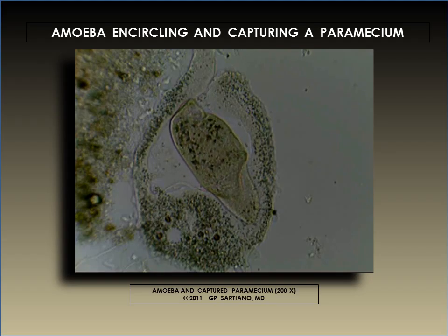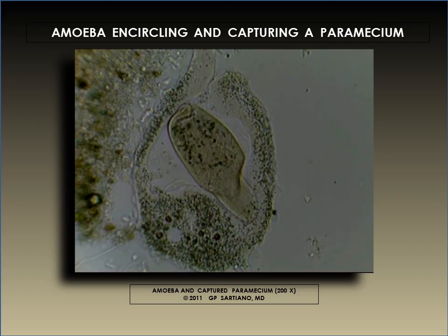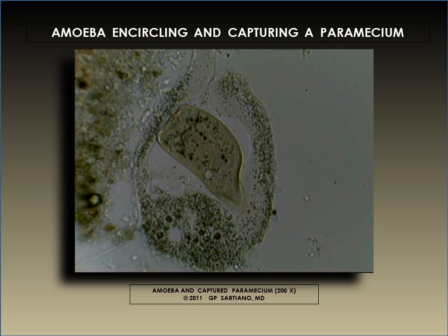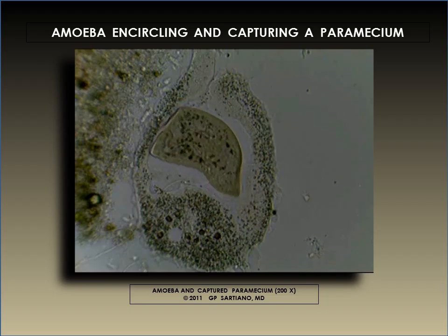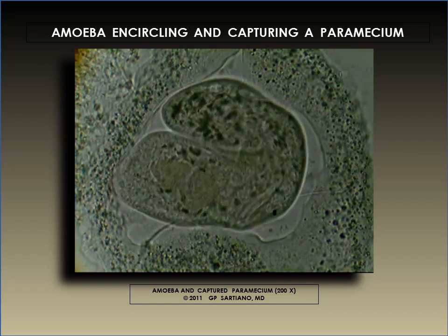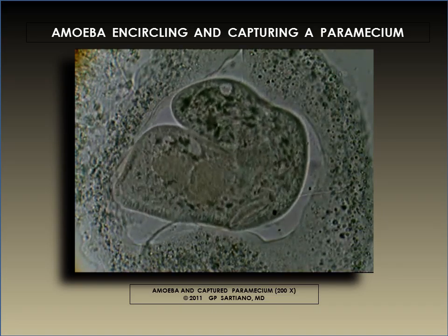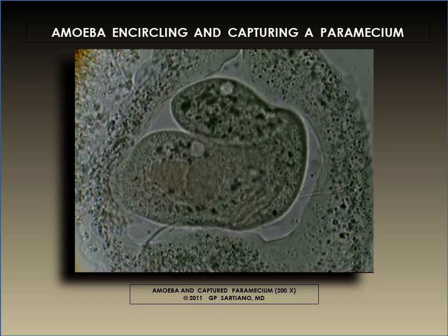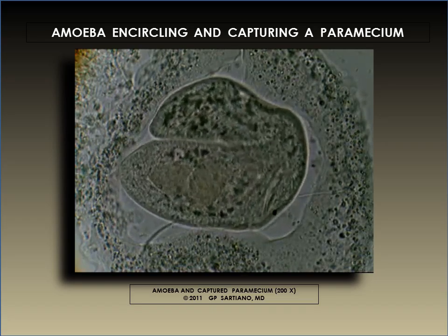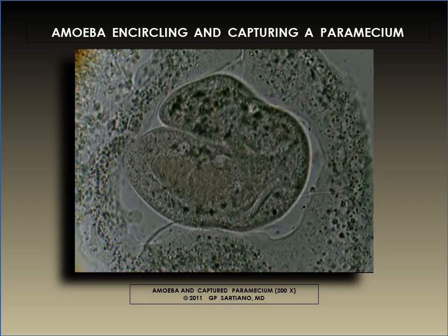It would not be surprising to see a sudden rupturing of the paramecium's cell membrane at this juncture, signaling victory for the predatory amoeba. And conditions do seem to get worse before they may get better. The paramecium is barely able to move in its enclosed state and looks like a developing embryo within an egg.